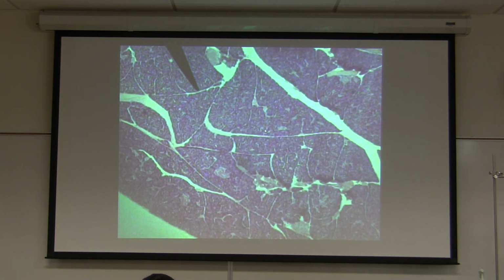Okay, what organ? Pancreas. What is the name of the structure? Islets of Langerhans. One here, one here. There could be some more. Okay, islets of Langerhans. Now, what organ? Pancreas. What system? Digestive system, or you can write down endocrine system. Either one, you're correct.